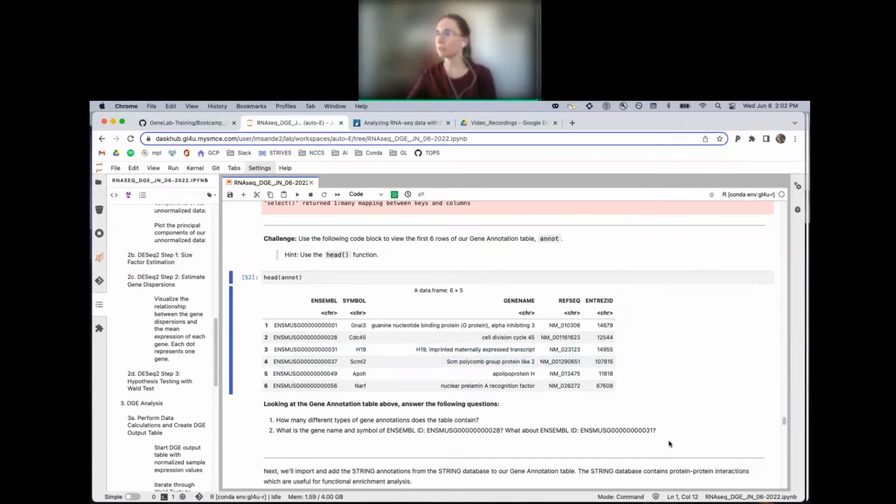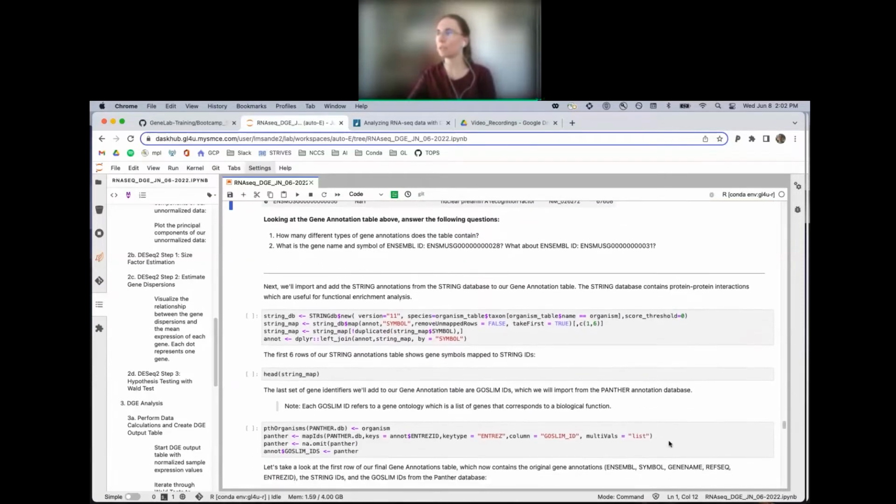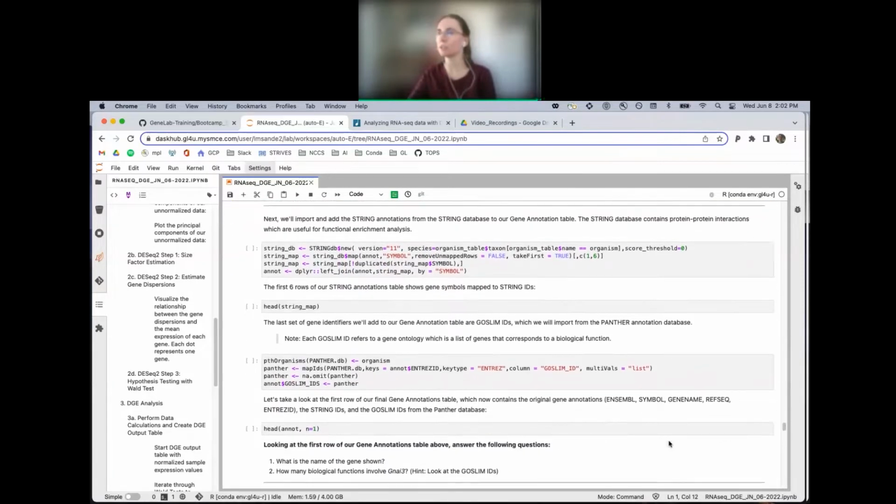All right. So before I get into this next section, we are going to be adding in other annotations from the STRING database. I would like to pause, and we've had an update to our database based on an error that our very own Mike Lee identified. So I was going to give Mike an opportunity to describe what he found in the update that we're going to make to our pipeline.